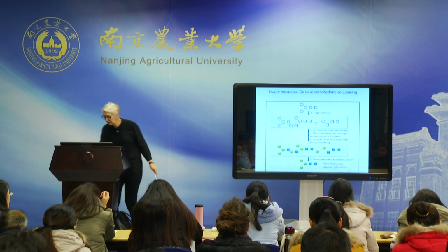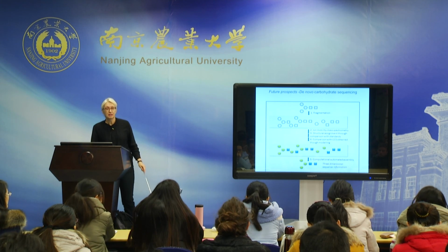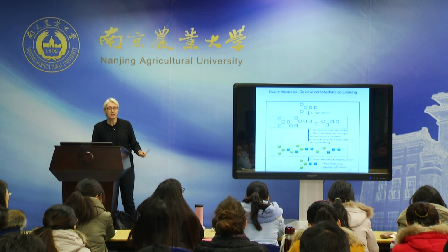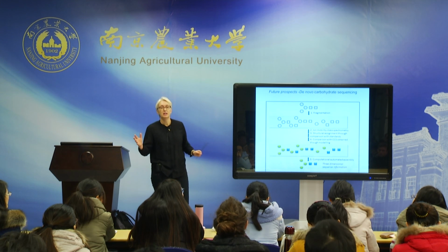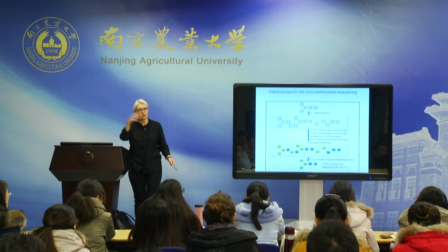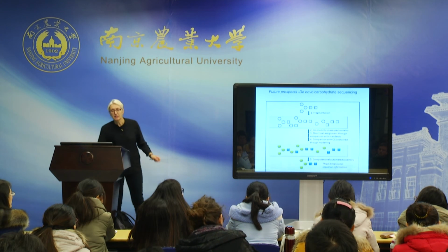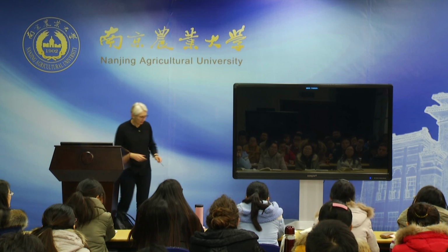Yeah, but I think it is actually in principle now feasible by incorporating techniques such as ion mobility. And I think there are other techniques out there. At the moment we're collaborating with people who do IR fingerprinting, so that's another method that you can integrate. So integrating all of this with these mass spec methods in the gas phase, the same time scale, I think will be very useful. So I'll finish there.